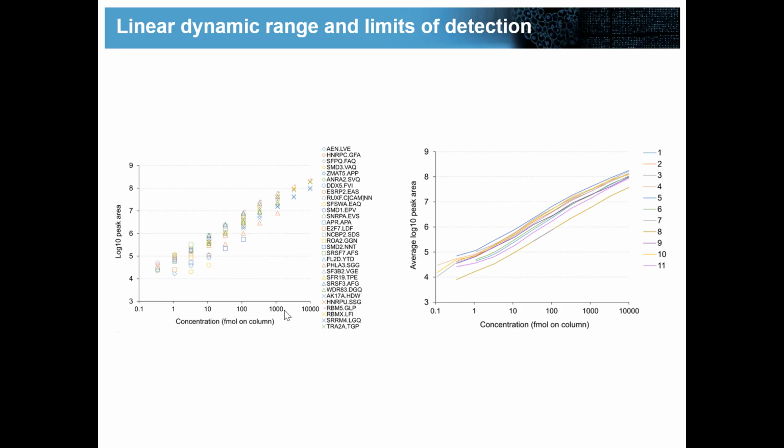Yeah, so I mean, there's no magic happening there. So the dynamic range that we can achieve is something like we see from these dilution curves, something like 4.5 orders of magnitude, and this is maybe pretty much in line with SRM. SRM maybe you can get 5 or a little bit more. So in plasma, for example, we've done studies in plasma.